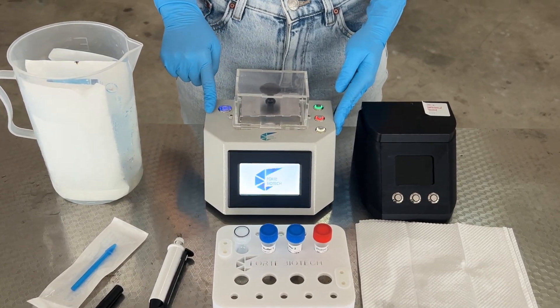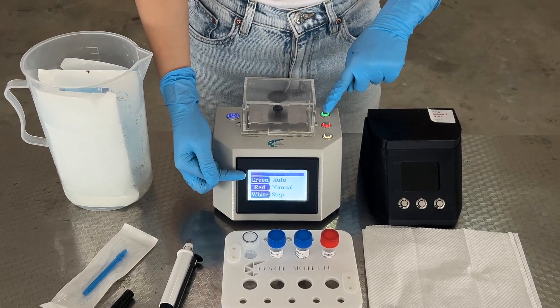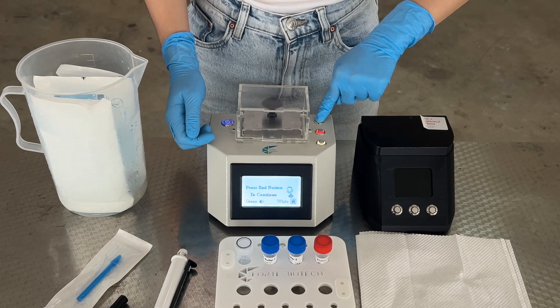To prepare the rapid heater, switch it on and press the green button to start the automated heating mode. The heater will beep when it reaches 80 degrees Celsius. Press the green button to mute it.